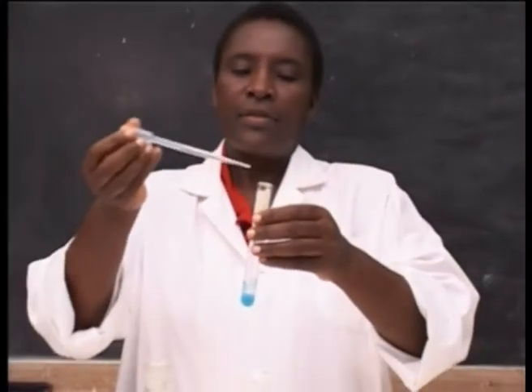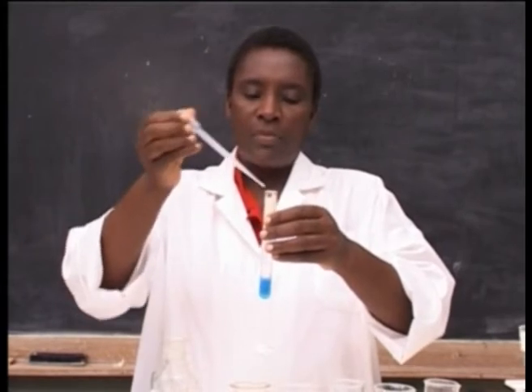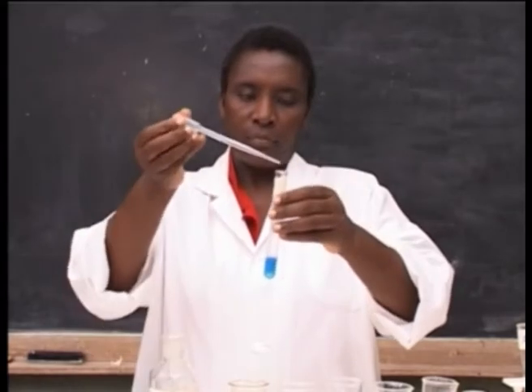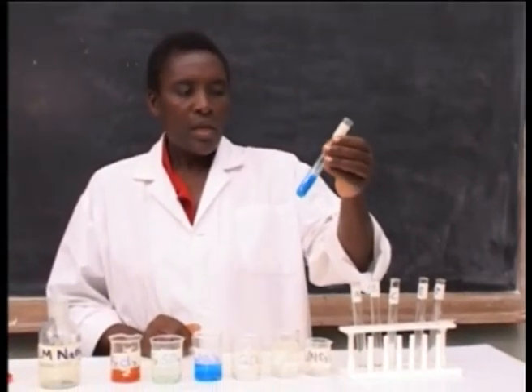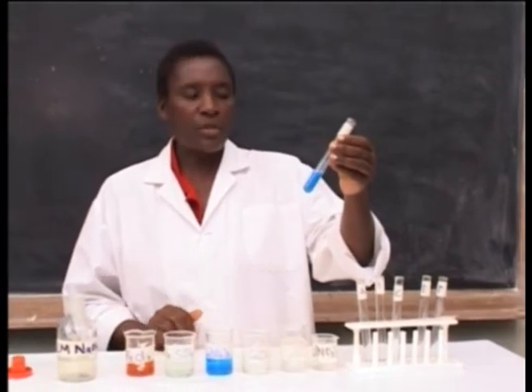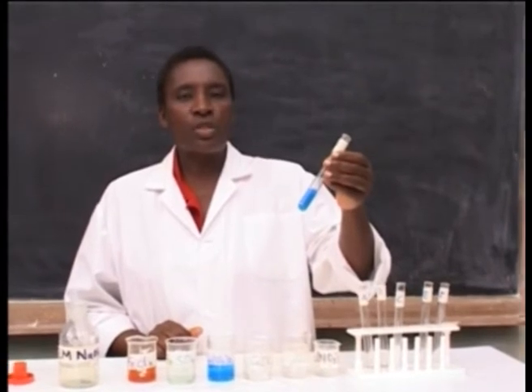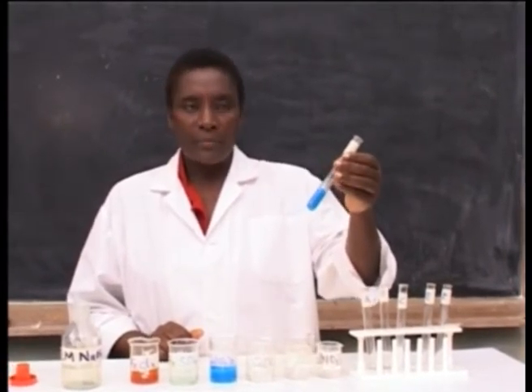Then add more sodium hydroxide solution. In excess of sodium hydroxide solution, there is a formation of insoluble copper hydroxide.